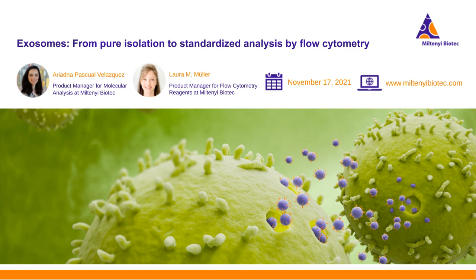You need a blue laser, 488 nanometers, and a red laser, 635 nanometers, and the ability to detect FITC, PE, and APC in three different channels. I think that's a setup which most of the flow cytometers can work with. There might be some exceptions, but most of the flow cytometers can be used, and then you can easily set up the assay on this flow cytometer.